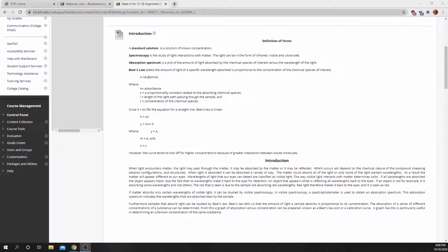We can see this with prisms. Light passes through the prism, it refracts, and it breaks apart into a rainbow because different colors of light interact with the glass slightly differently. Now, in this kind of spectroscopy, we pass it through a solution. You know, substance A dissolved in substance B. It's usually some chemical dissolved in water for the work we're doing.